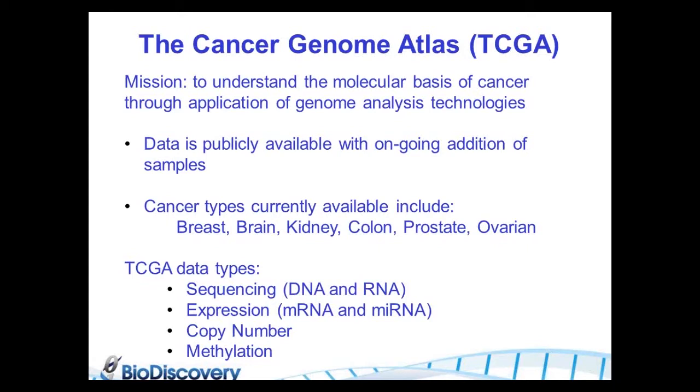A little background about the Cancer Genome Atlas. I'm sure most of you are already aware, but the mission of the Cancer Genome Atlas, or TCGA, is to understand the molecular basis of cancer through the application of genome analysis technology. All of the data that's generated is publicly available with the ongoing continuous addition of new samples.